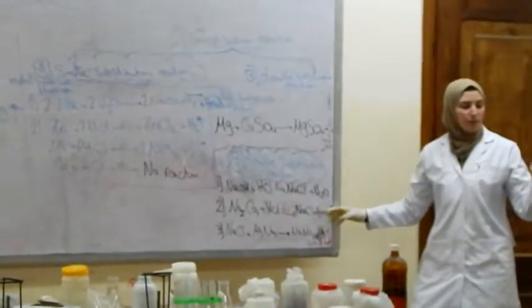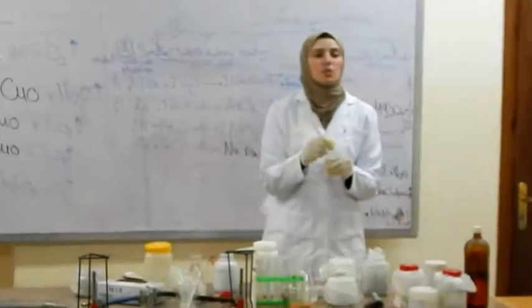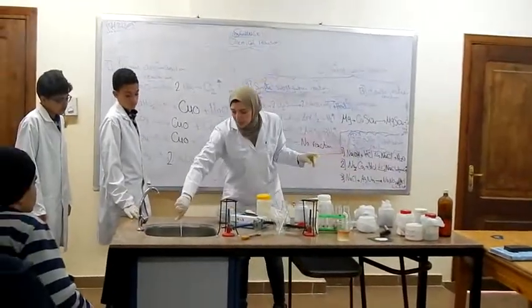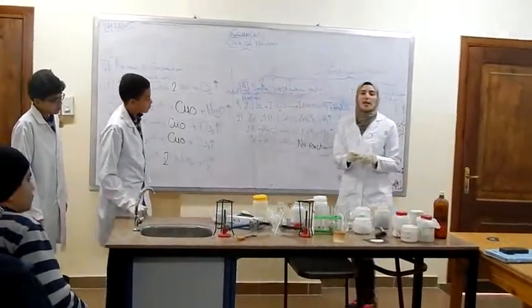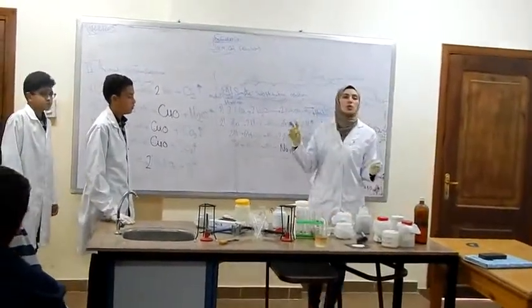Now we have sodium chloride, water and carbon dioxide gas evolved. The last activity is the reaction between sodium chloride and silver nitrate, two soluble salts.